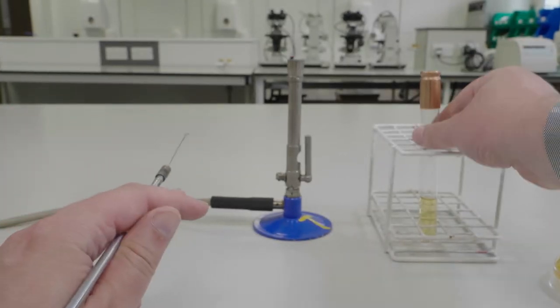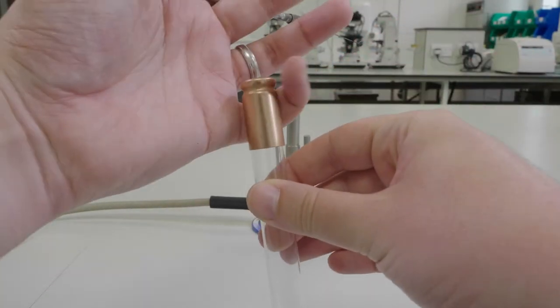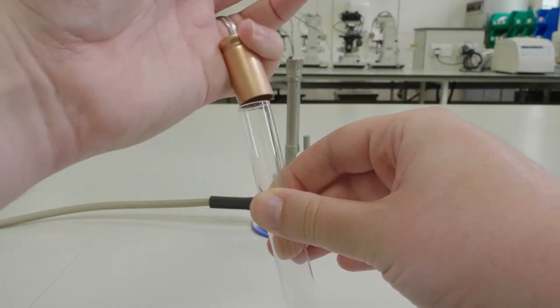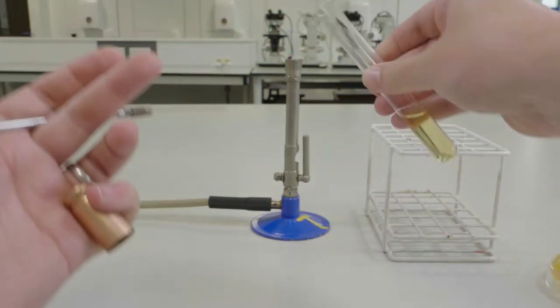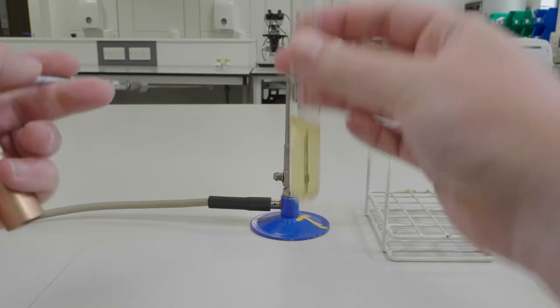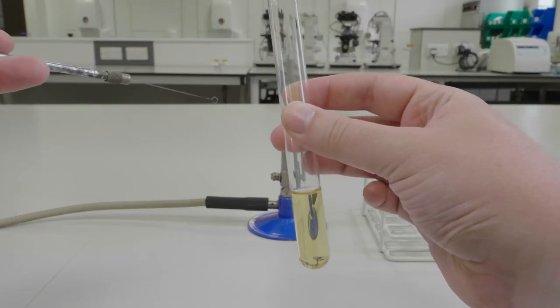Next, get your test tube containing sterile nutrient broth and remove the lid using the little finger of your dominant hand. Pass the end of the test tube through the Bunsen flame to kill any lingering organisms stuck to the glass.